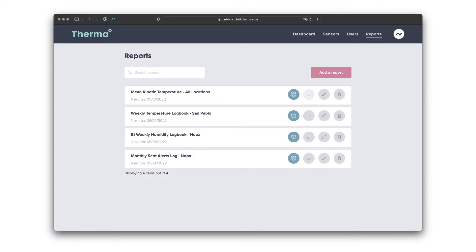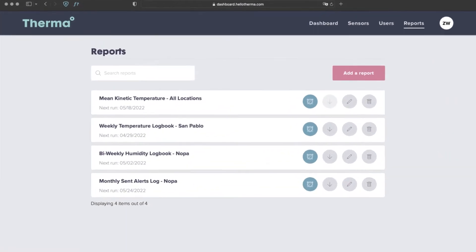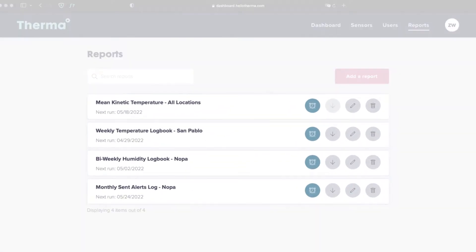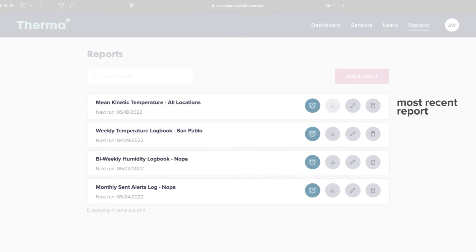When you go to the Reports tab, you'll see all of your historical reports in descending order by their last run date. This means that your most recent report will be on top.